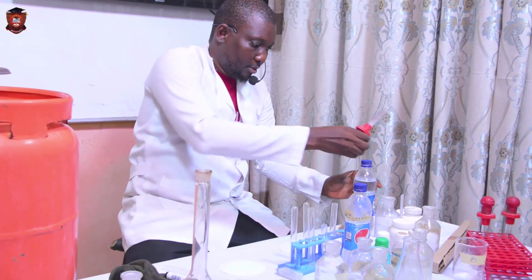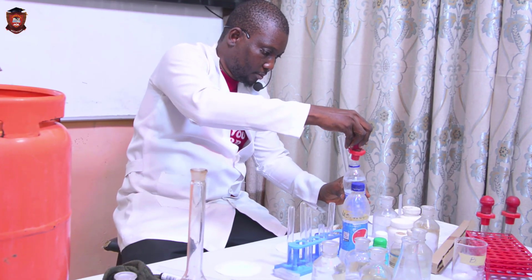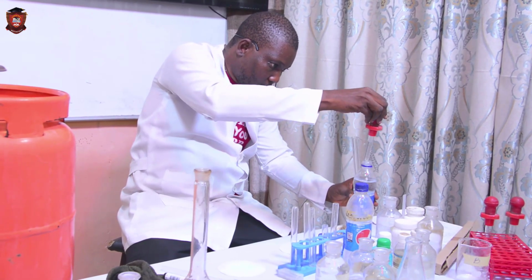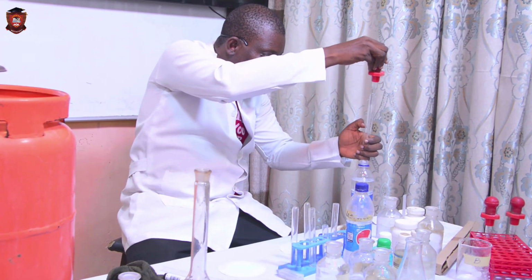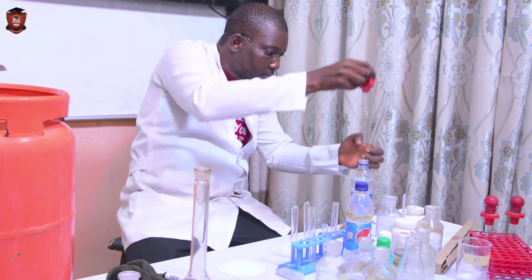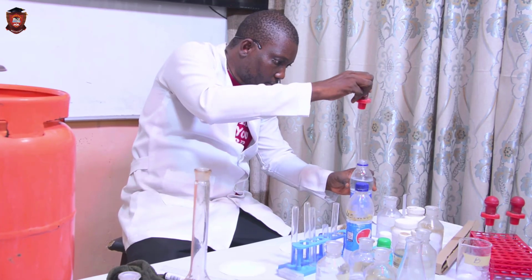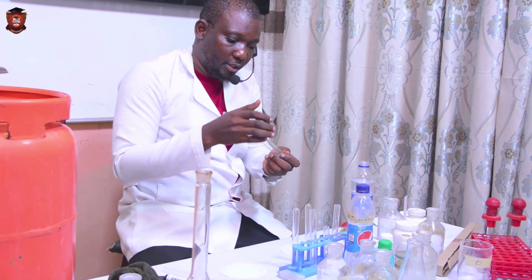So I think I have to 10 now. So you shake thoroughly. You can use a stirrer.